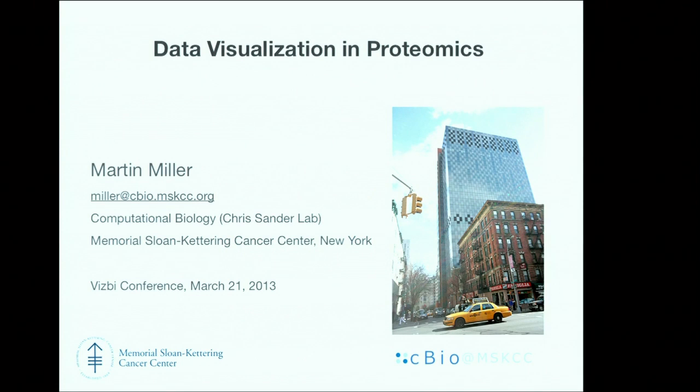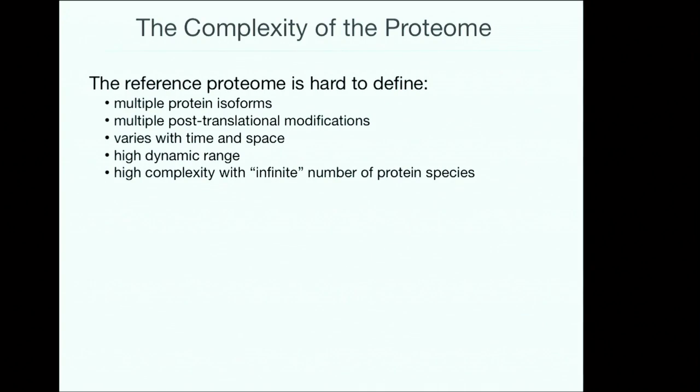I'm going to be talking about data visualization in proteomics. And as we heard this morning from Sean that even one protein is a beast in itself, then imagine the whole proteome, and it's going to be a monster, I think. Because of the complexity of the proteome, it's really hard to define. It's not like in genomics where the reference genome is more clear.